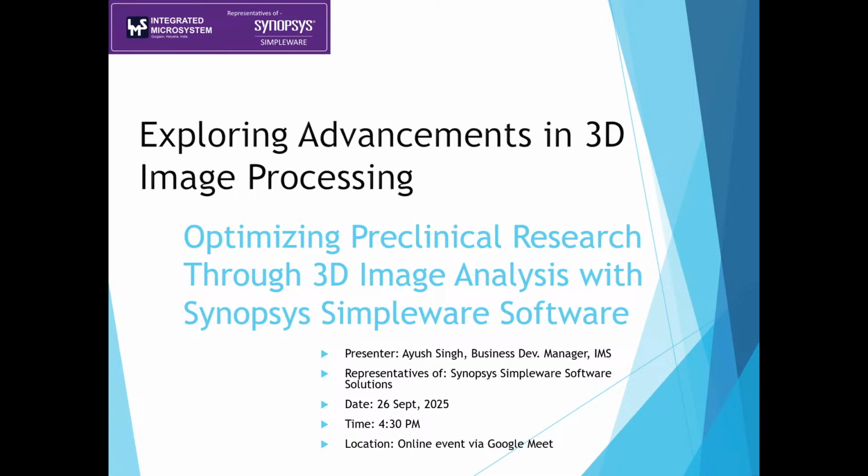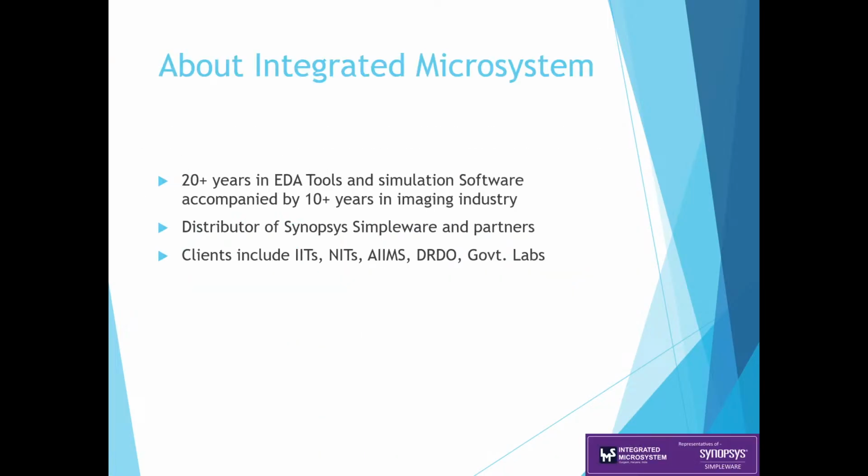So in this presentation, I shall be overviewing all the features that we have pre-existing in Simpleware, which can enhance our segmentation methods. Apart from that, for the audience who hasn't used Simpleware or hasn't worked with image processing in the past, I shall be briefing what image processing basically stands for and how we are utilizing it in Simpleware.